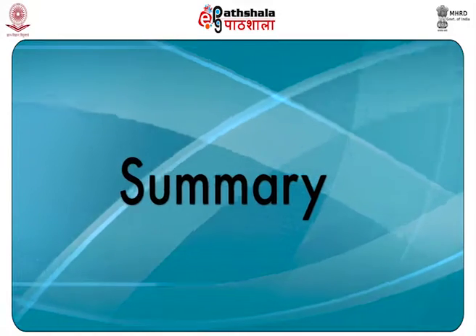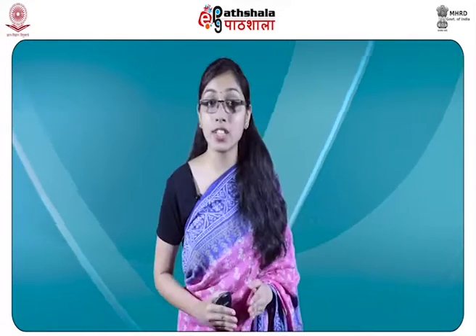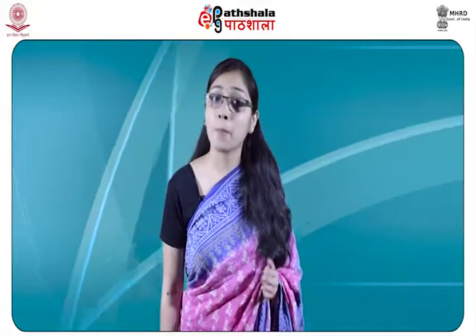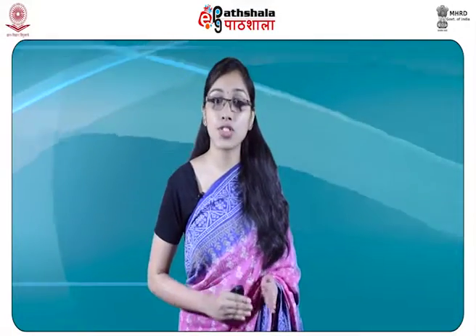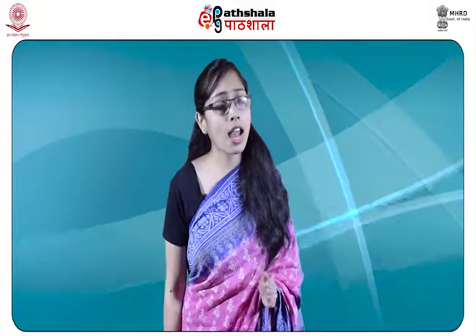Now students, let us summarize this module of all that we have studied. Latent friction ridges are typically comprised of chemicals secreted by eccrine and sebaceous glands plus miscellaneous contaminants. The chemical reactivity of these friction ridge components has been exploited by crime scene examiners who utilize optical, physical and chemical means so as to develop visible images of latent friction ridge impressions.